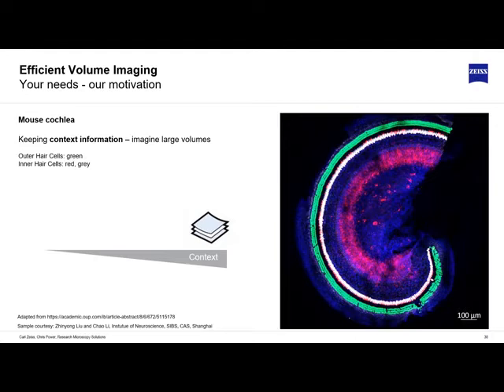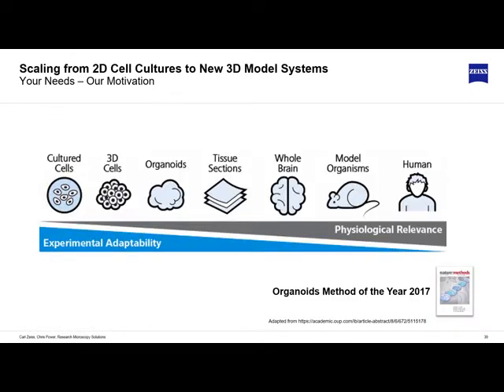So you don't just want to get these high-resolution images, you want to get them with some level of scale. And we see over time that isn't just changing from an individual lab, but there is a general drive to going from the left hand of the picture shown here, where we look at individual cells, to trying to get to larger and larger model organisms. And again, organoids is something which has become a big trend and drive in the past few years, where we look at larger and larger things.